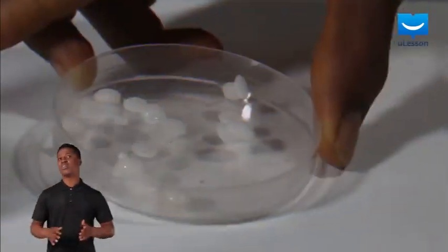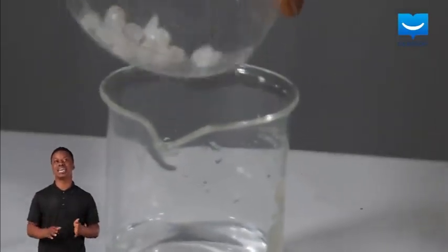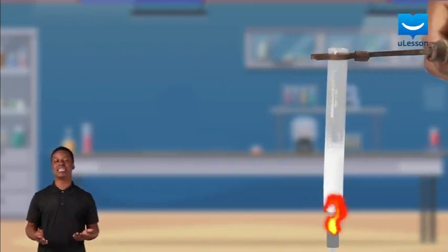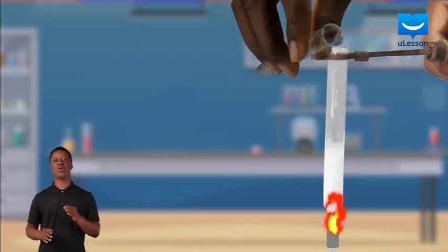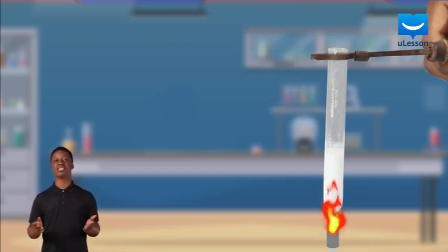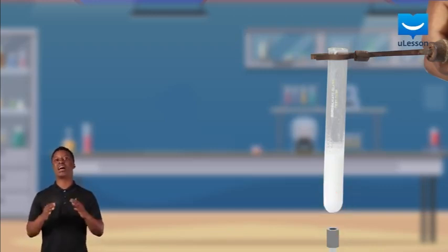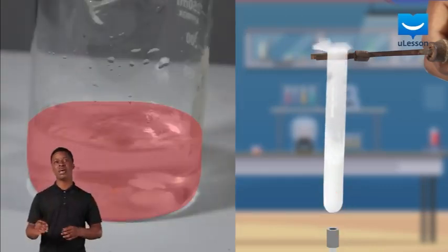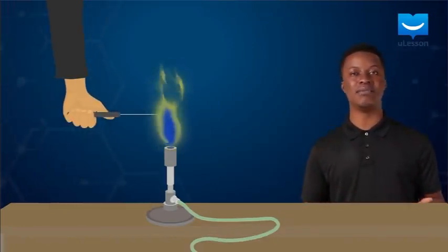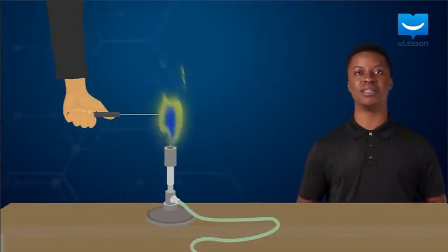The test carried out on a sample could involve a physical or chemical change. For example, the unknown test sample can be added to water in a beaker to detect its solubility. It may also be heated or treated with test chemicals called reagents to observe the chemical reactions that occur. In most cases, these chemical reactions are observed by noticing color changes, precipitates, or the evolution of gases. Sometimes an unknown sample can also be heated in a flame to observe the color imparted on the flame.